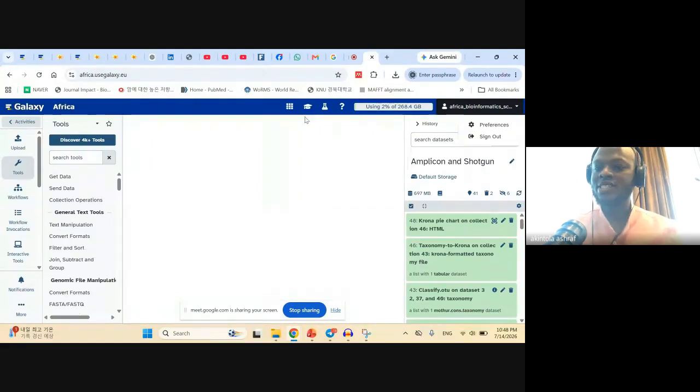After you have gotten your account opened, African Galaxy will give you about 270 gig of data that you can use for your analysis. And this is one of the peculiarities of being a bioinformatician.